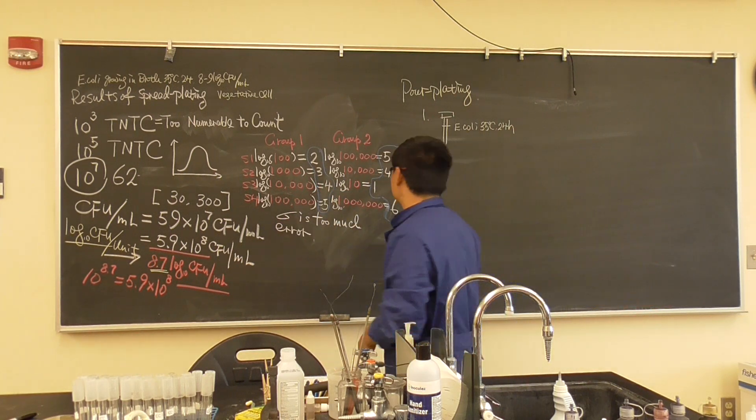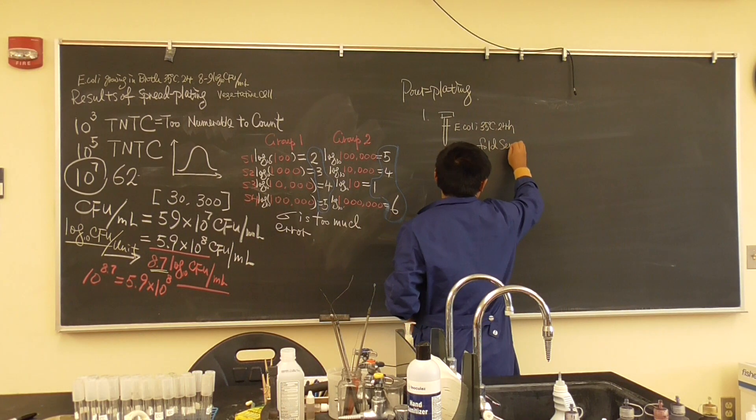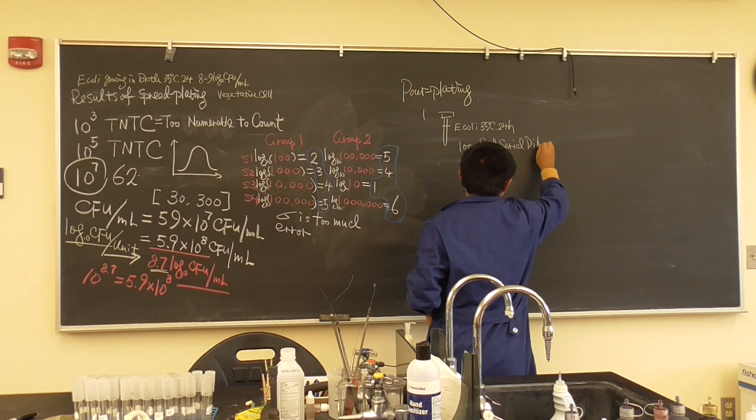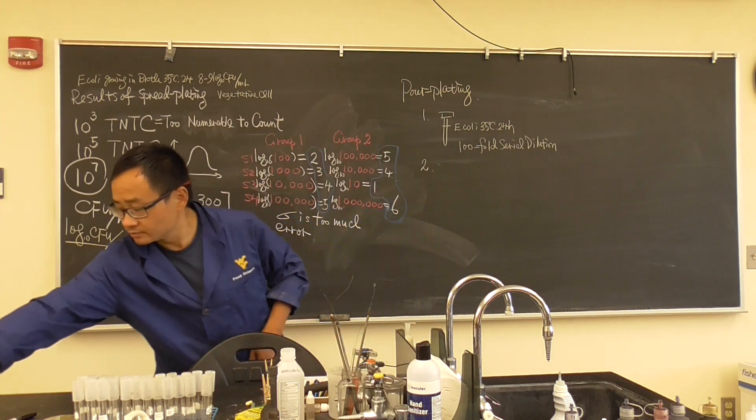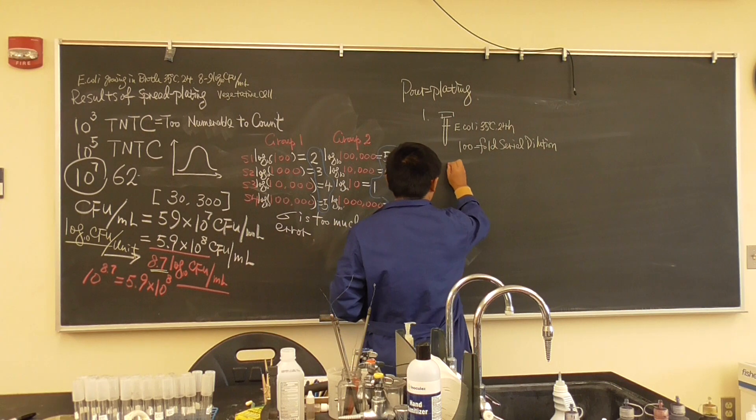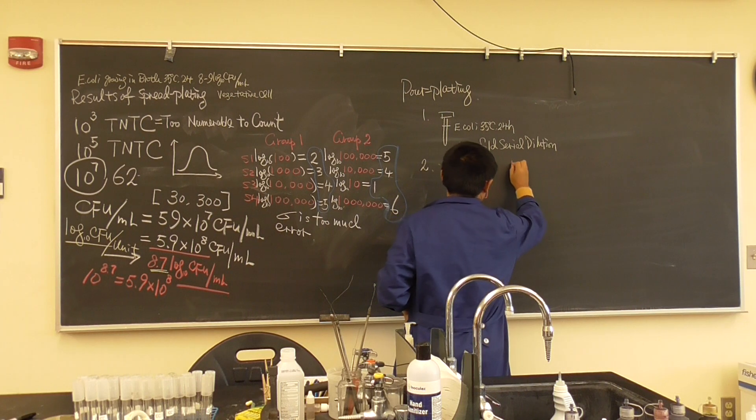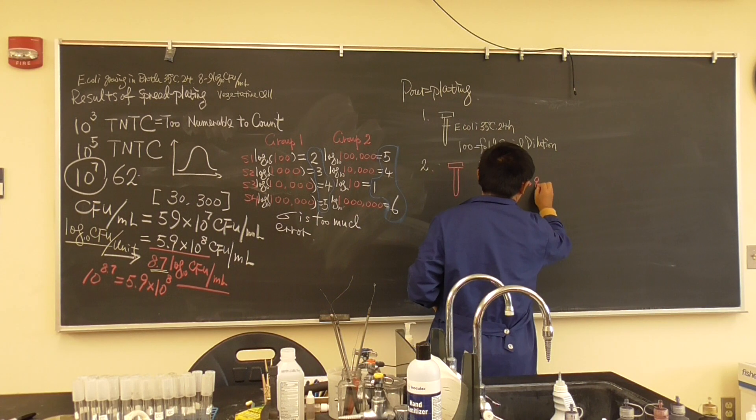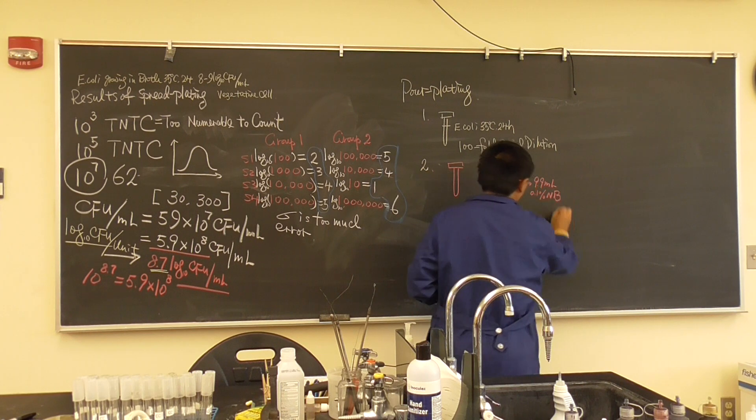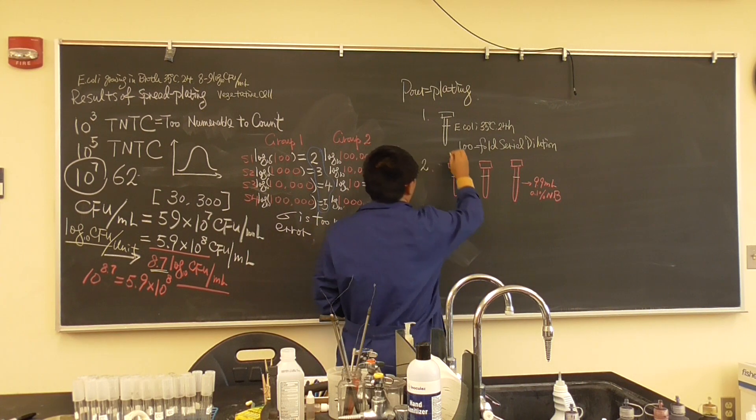First thing, what we do? Serial dilution. So let's do a hundred-fold serial dilution. Now how do you do? Do you remember? You need to grab three dilution tubes. These three dilution tubes, each containing 9.9 ml 0.1% nutrient broth.